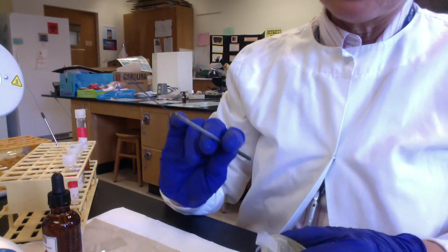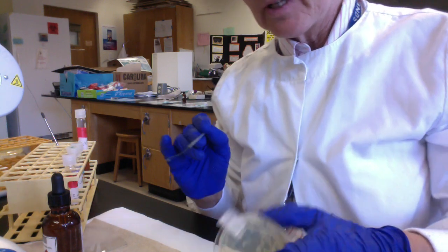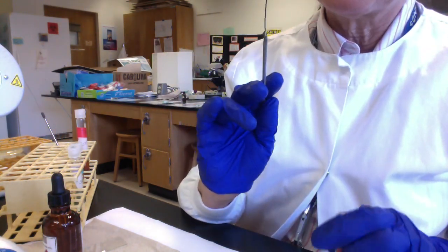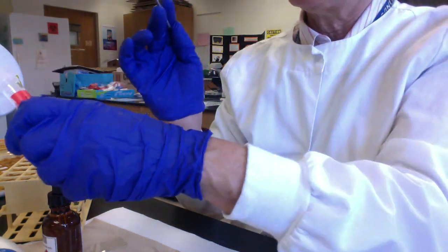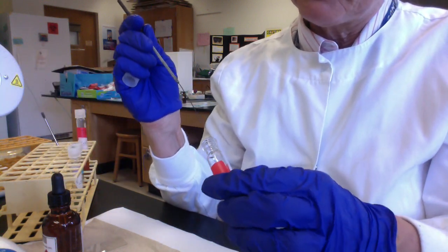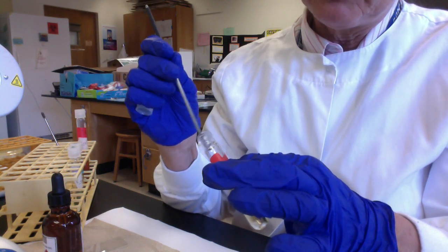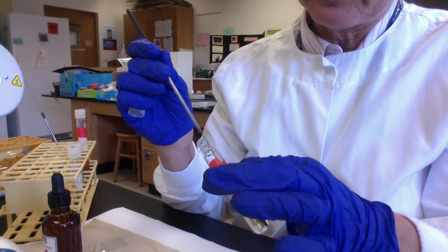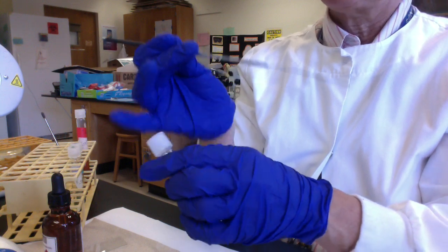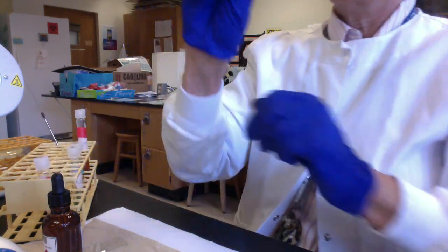So the way we run this test, I've sterilized my needle. I'm going to harvest my E. coli. And I'm going to inoculate methyl red broth. And methyl red broth is broth that has lots and lots of glucose in it. Because we want our microbes, if they can ferment the glucose, to make lots and lots of acids to drop the pH down below pH 4.5. Okay, so I inoculate. I want to check just to make sure I have a loose cap so it can vent. Okay, and then I'm going to re-sterilize.